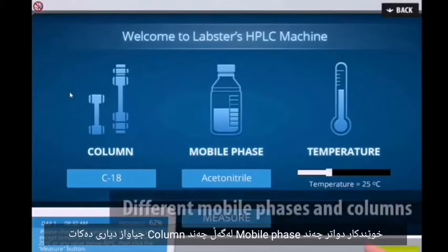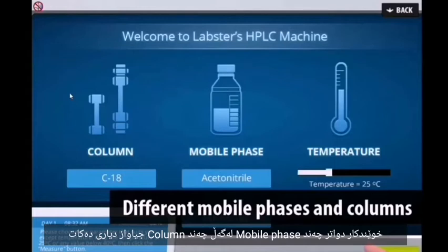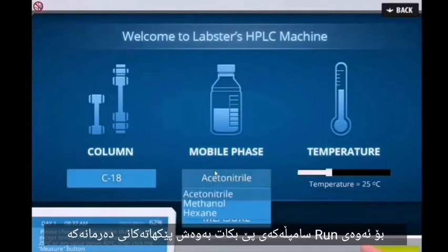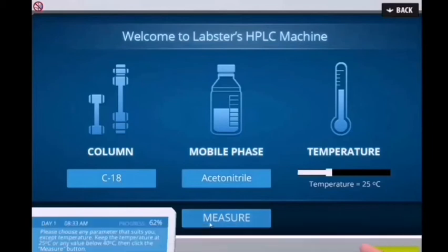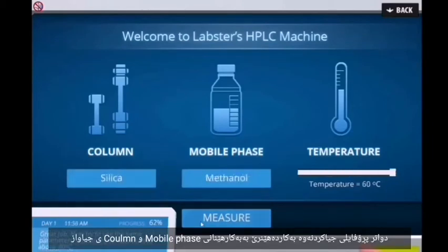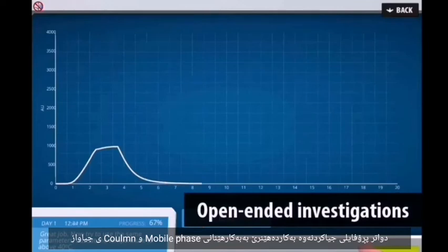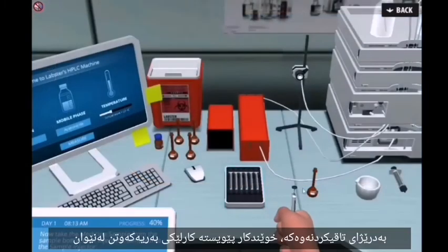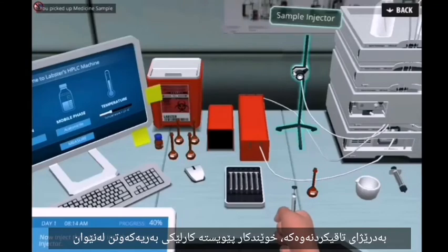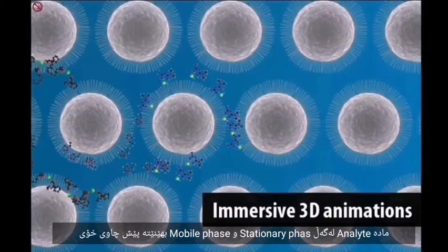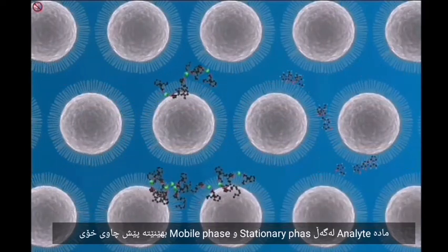Students will then select different mobile phases and different columns with which to run their experiment. They will separate the components of a drug and measure the concentrations, then compare the separation profile using different mobile phases and columns. During the experiment, students will be able to visualize the lipophilic interaction between analyte and both the stationary and mobile phase by watching a 3D animation.